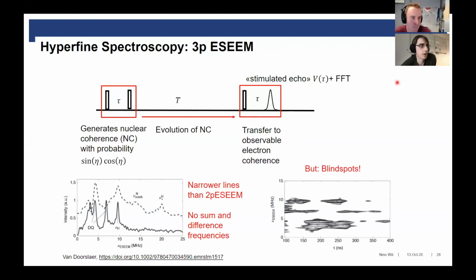Okay, thank you. So a question from Dima. Can you comment on the use of AWG in EPR experiments? And for my benefit, can you also say what AWG is? So it's an arbitrary waveform generator. I think this is already normal in NMR, that you basically just digitally program your pulses, and you can do swept pulses or anything. And basically our group, among other groups, is working on using these for EPR experiments.